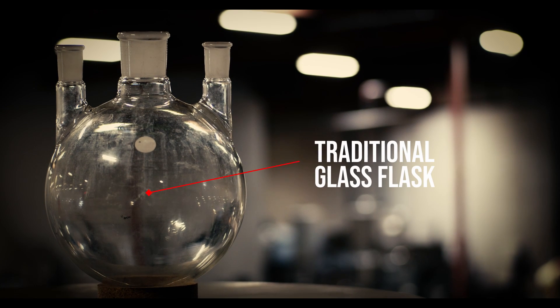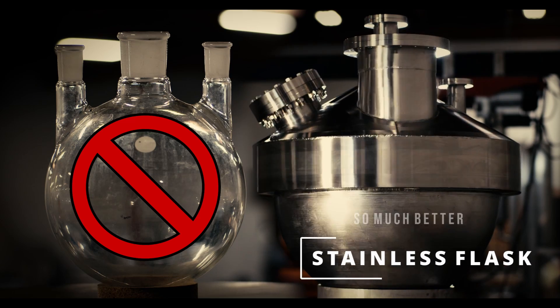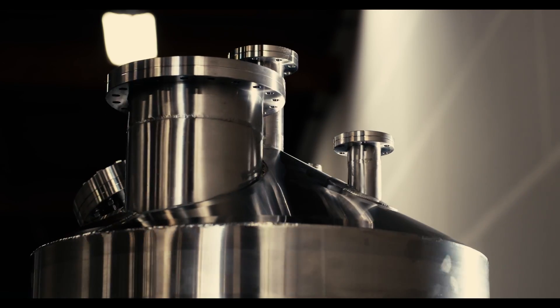What we have here is a boiling flask that's traditionally made out of glass, and we made it out of stainless. The glass keeps breaking. The stainless doesn't break.